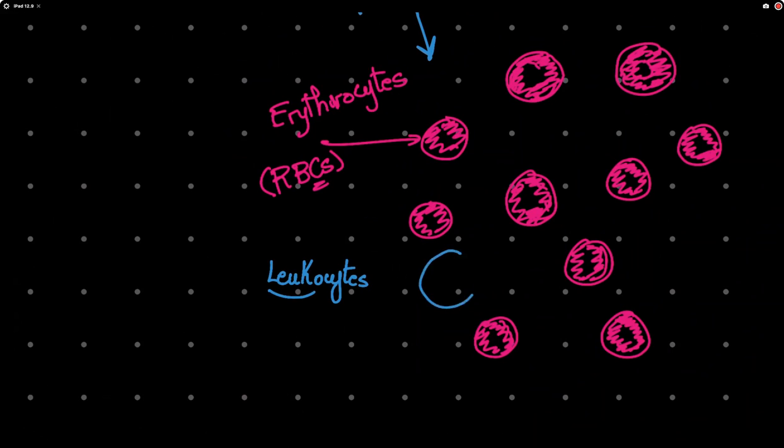And the white blood cells, the two most common forms that I will see in the blood are the neutrophils, which I will see with an undefined shape of a nucleus inside with lots of scattered granules in the cytoplasm. Those are my neutrophils. And again, neutrophils are a type of leukocytes.